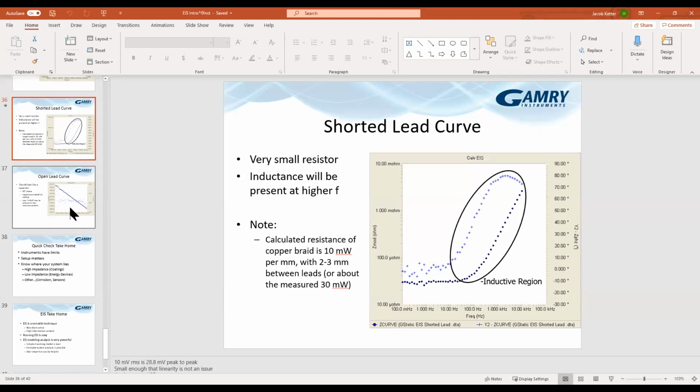I don't know that I can tell you what the best response for you is. If having excess current flowing through there is a problem, then galvanostatic may be the better solution for you. If that voltage change is causing your impedance to be unstable and give invalid data, then maybe anchoring it to a single potential, then relaxing and watching what the open circuit does.